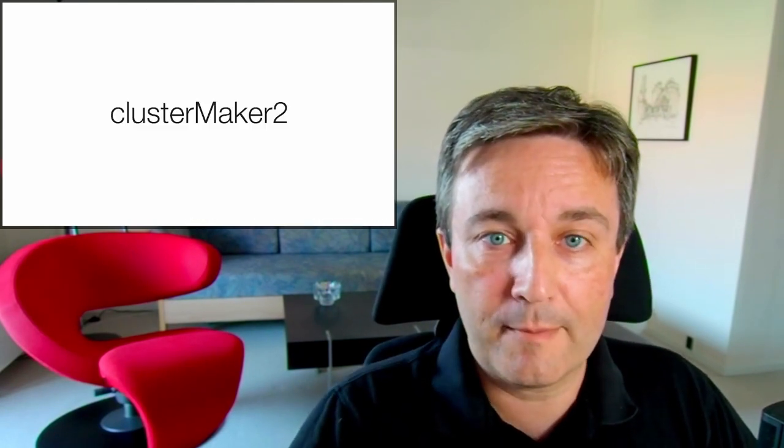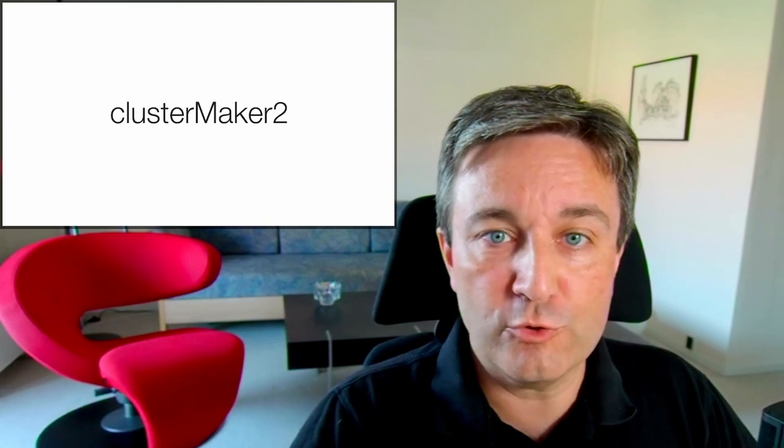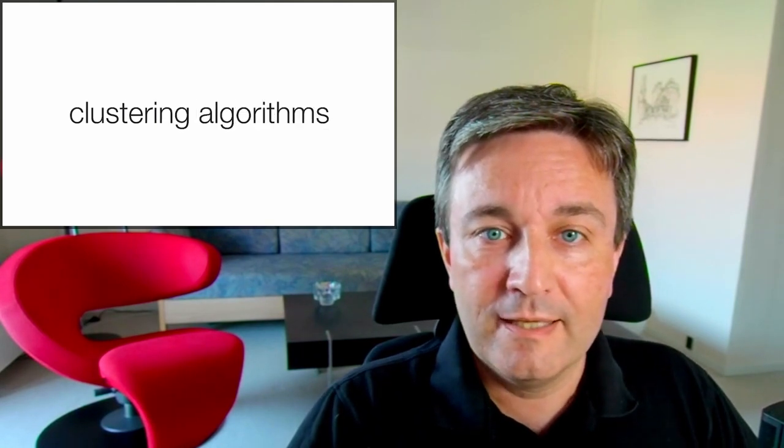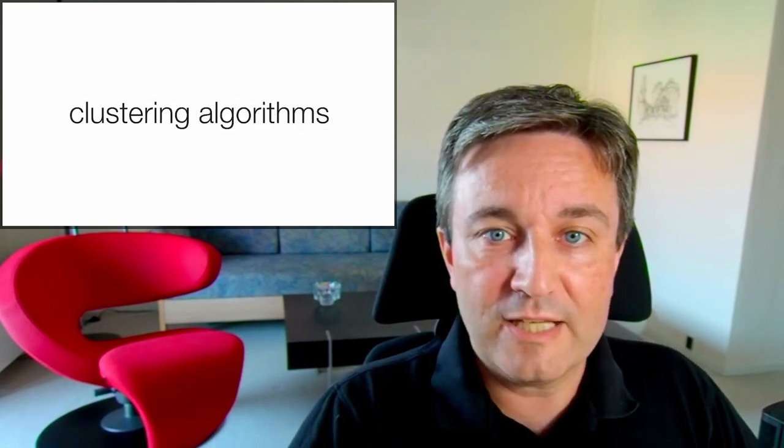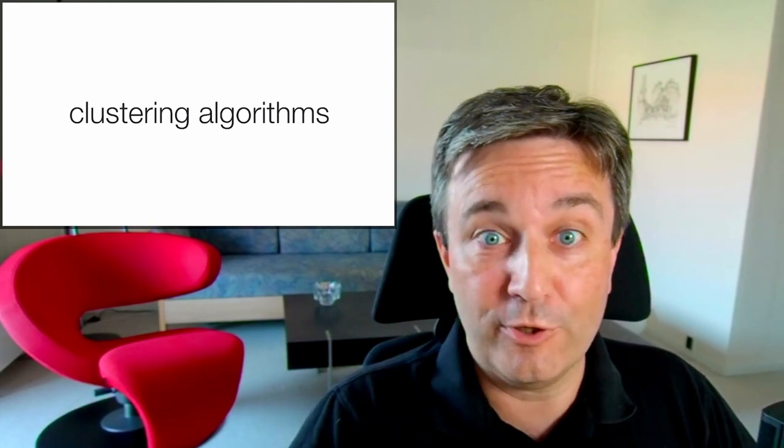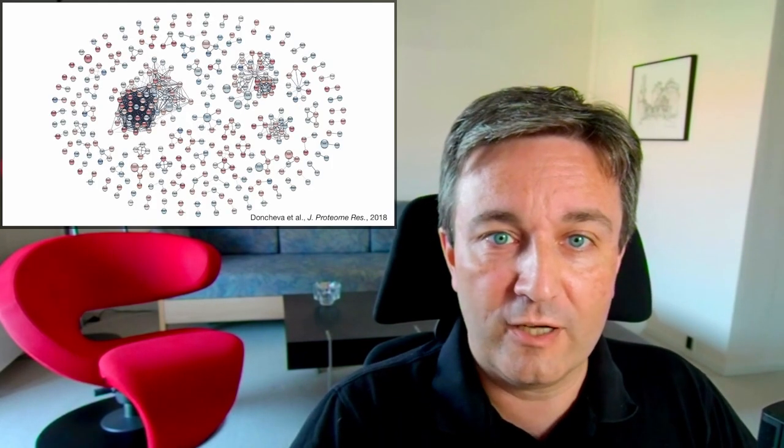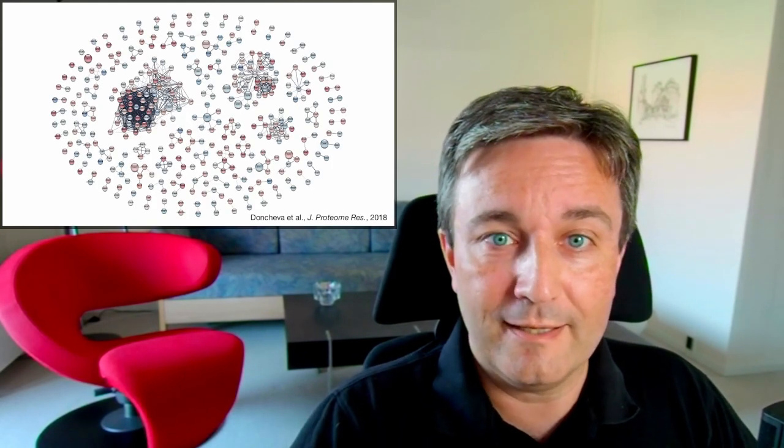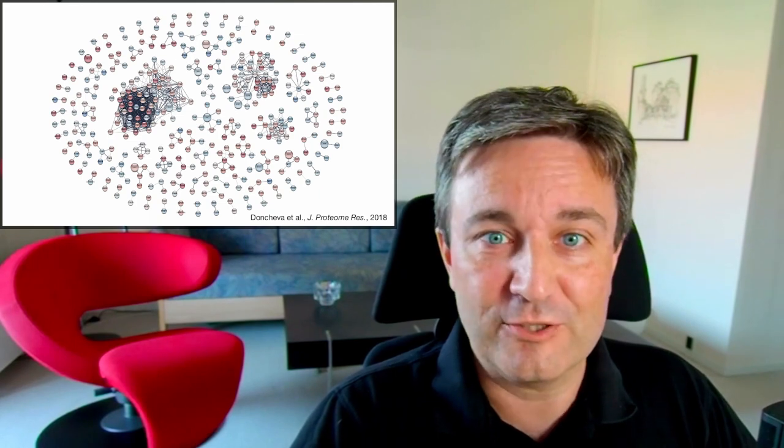Another example of an app is ClusterMaker 2. It provides a wide range of different clustering algorithms so that you can take the network that I just showed you and cut it up and make an arguably better layout like this.